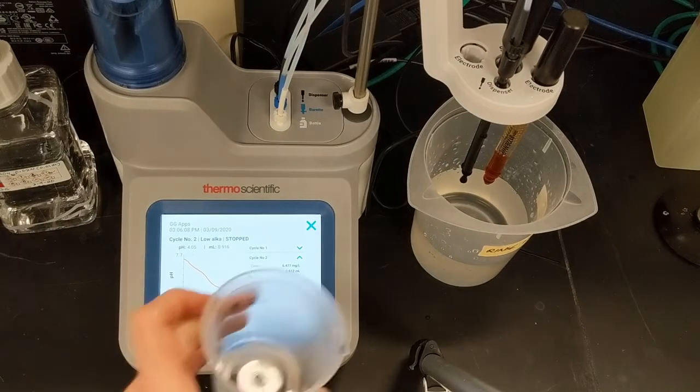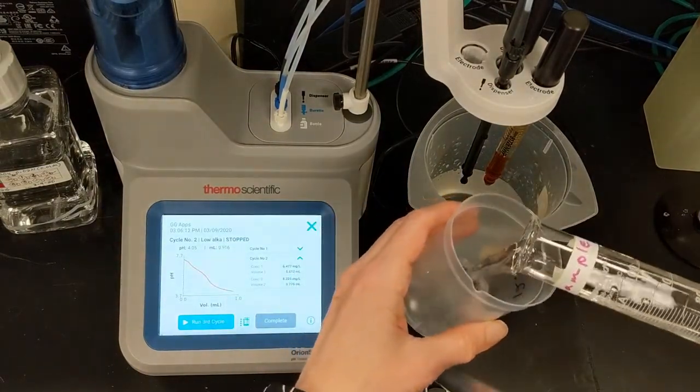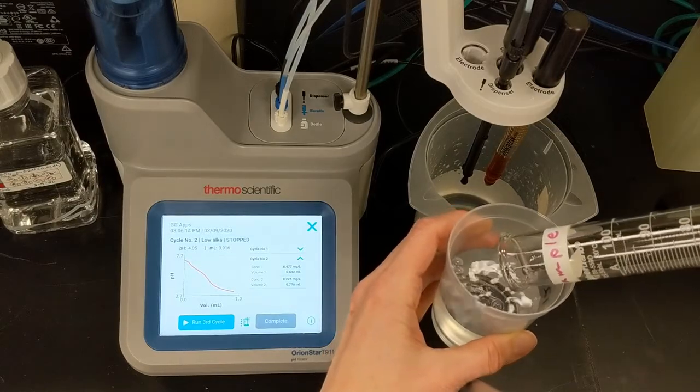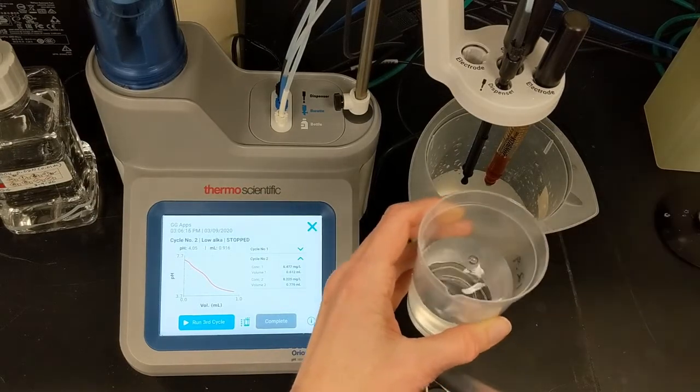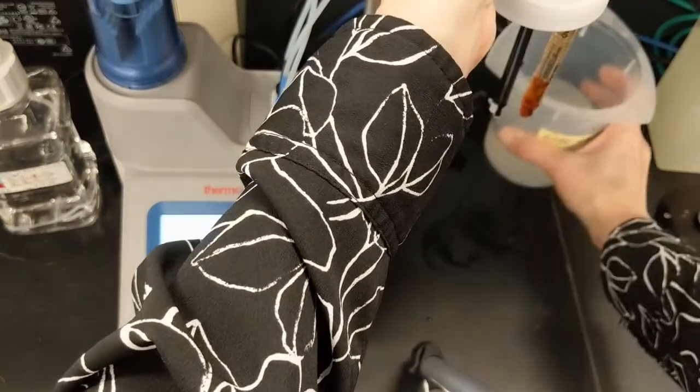Again, I measure 100 ml of the sample in a graduated cylinder and transfer to a clean beaker. I can run one to five cycles for each sample. This is my third and last cycle for this sample.